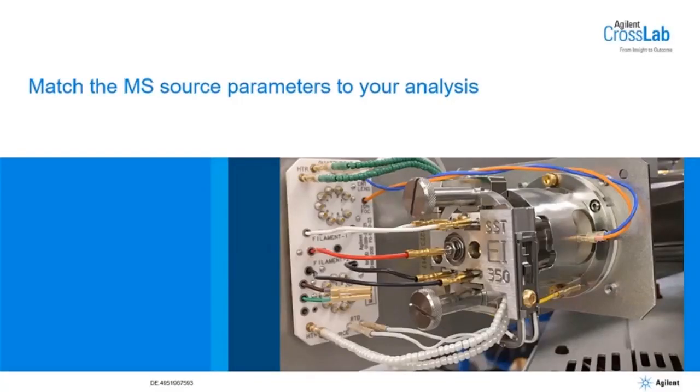So we've already matched consumables to the application, and in those discussions, we briefly discussed extraction lenses. Here we're going to talk more about the flexibility the different lenses provide, along with additional parameters to get the most out of your mass spec.